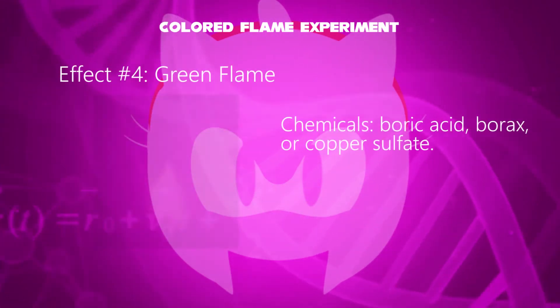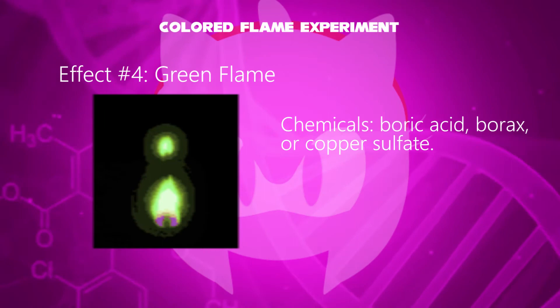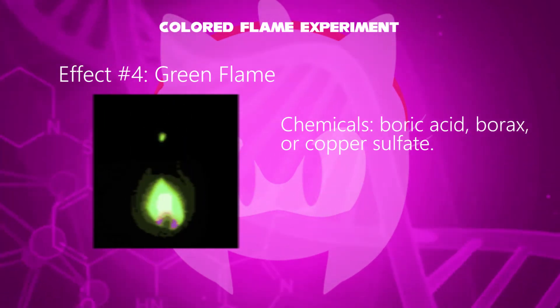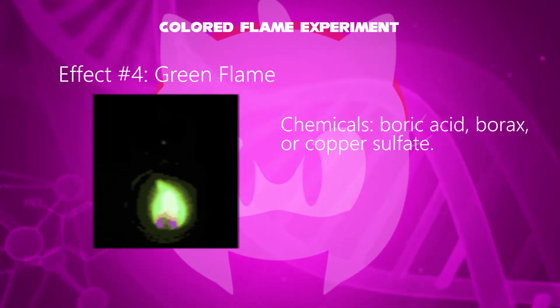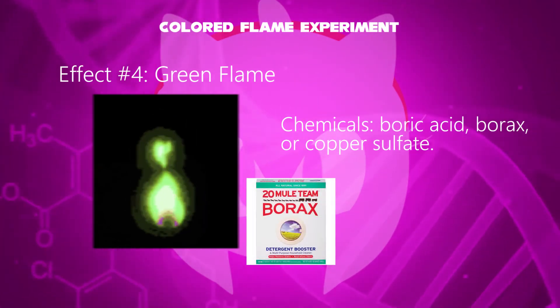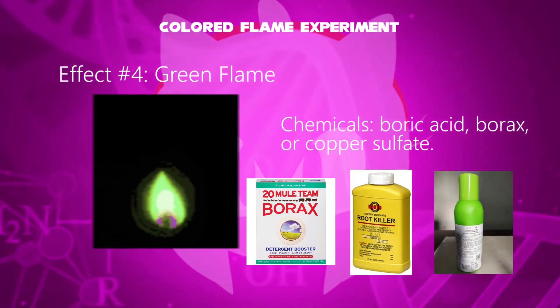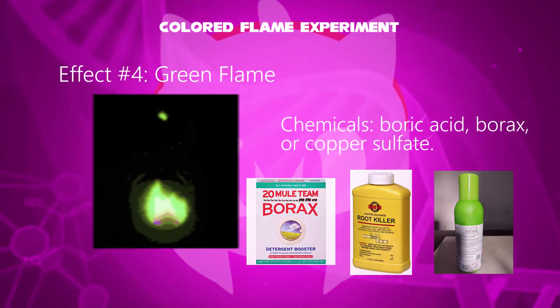In the fourth effect, a green flame has been evolved. The added chemical is either boric acid, borax, or copper sulfate. Its applications are boric acid as a disinfectant or insect killer, borax as a laundry booster, and copper sulfate as a root killer.